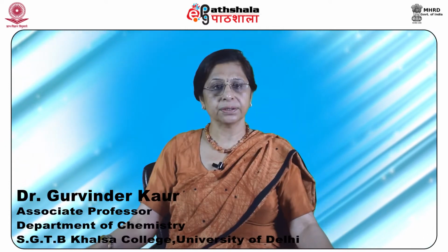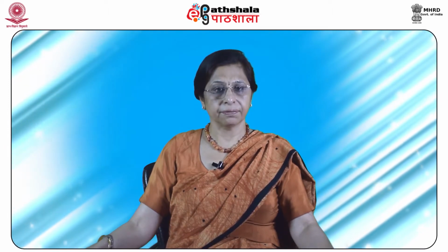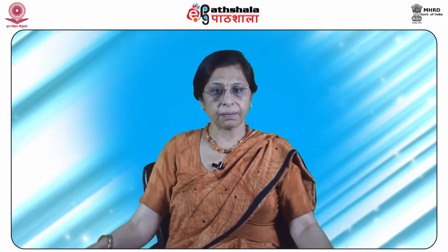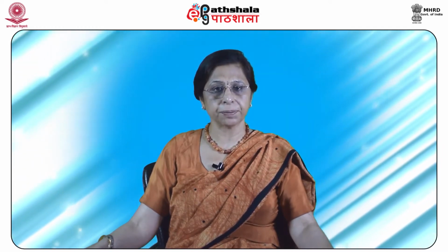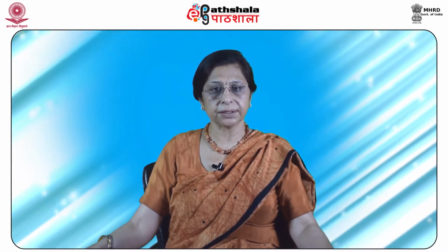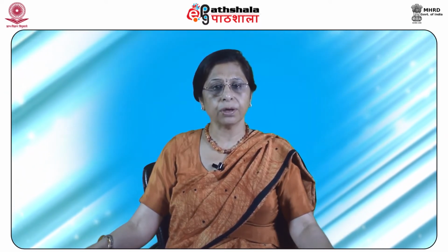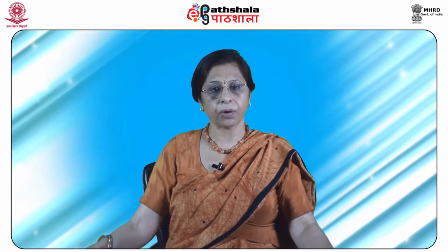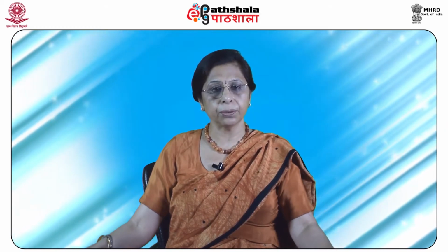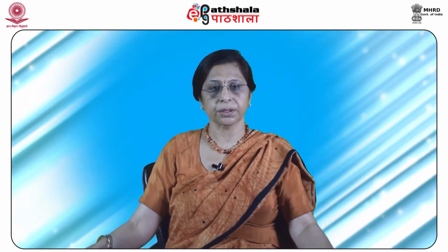My dear students, after studying this module, you shall be able to define spectroscopy, learn basics of ultraviolet visible spectroscopy, learn different kinds of transitions that can take place within the molecule, more so organic molecules which are important from forensic point of view. And you should be able to learn what are chromophores and auxochromes.